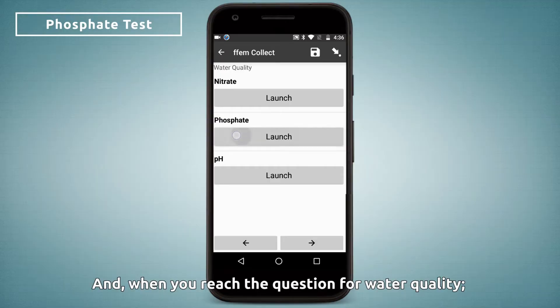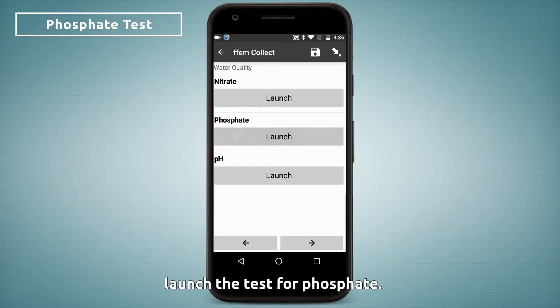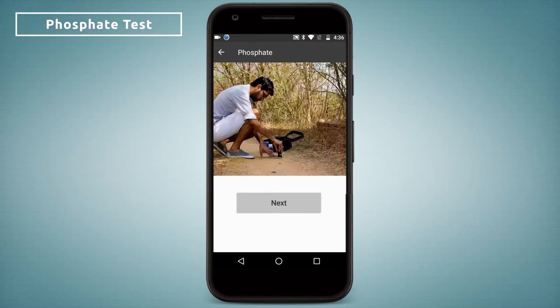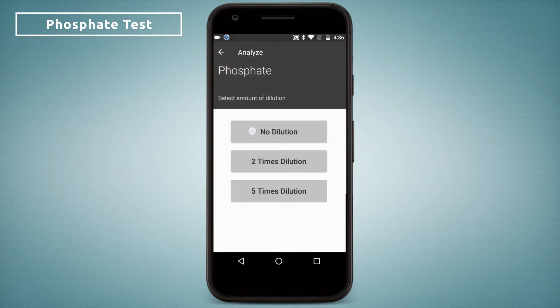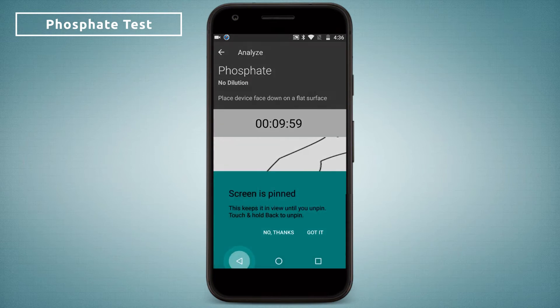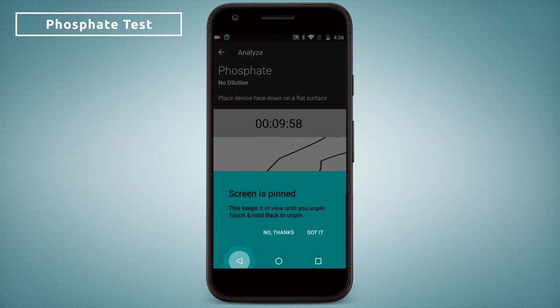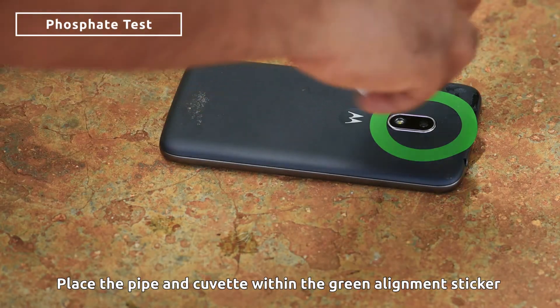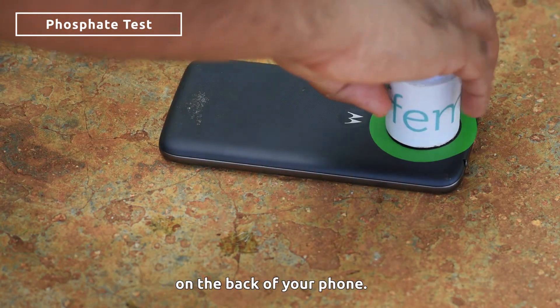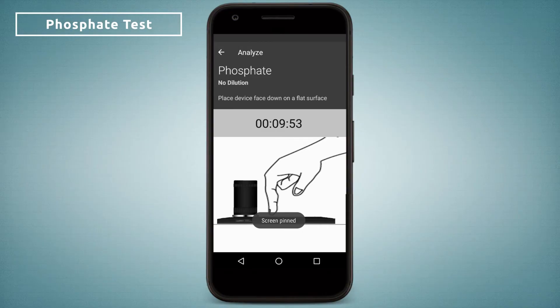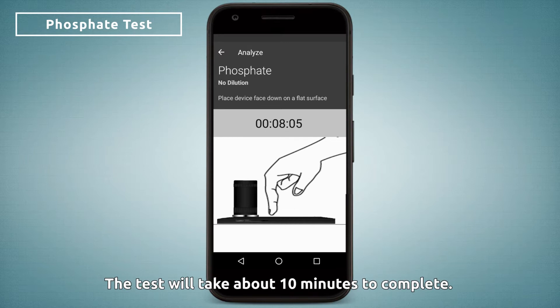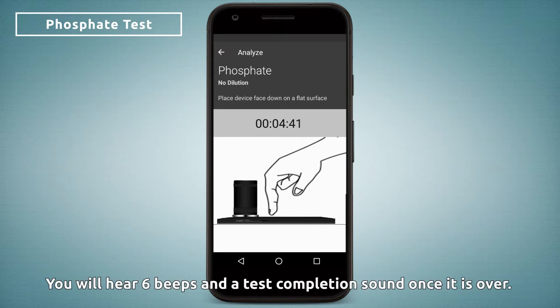When you reach the question for water quality, launch the test for phosphate. Place the pipe and cuvette within the green alignment sticker on the back of your phone. The test will take about 10 minutes to complete. You will hear 6 beeps and a test completion sound once it is over.